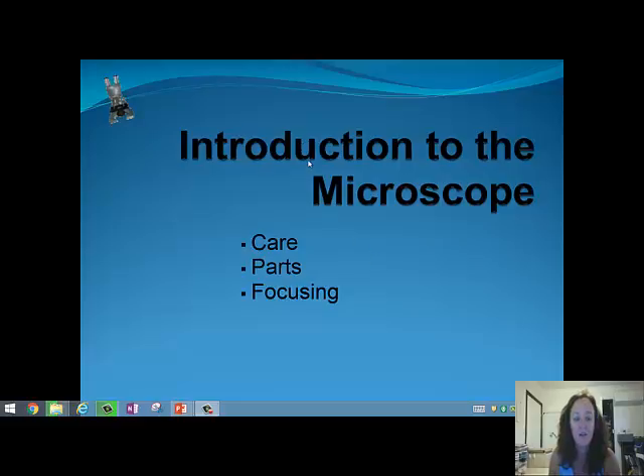Hi class, it's Mrs. Harris. I thought it'd be good to go over the microscope as part of your biological skills, because we are doing a unit called 'Inside the Cell' and you need to know how to use your microscope. For some of you, you may have forgotten some of this, or it's just a good skill refresher. So let's have a look at the care of the microscope, the parts, and how to focus.